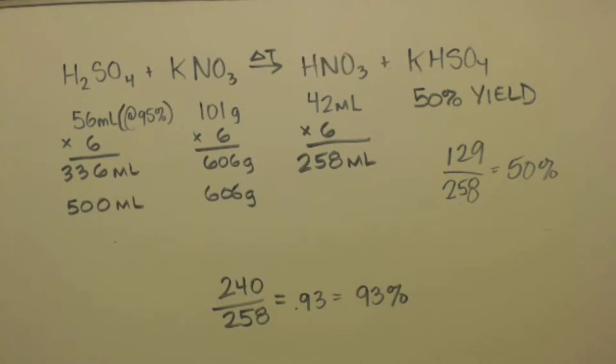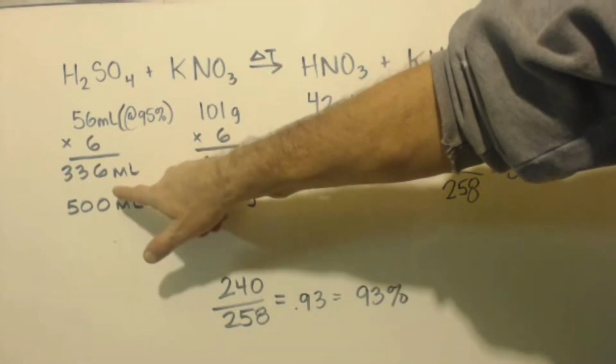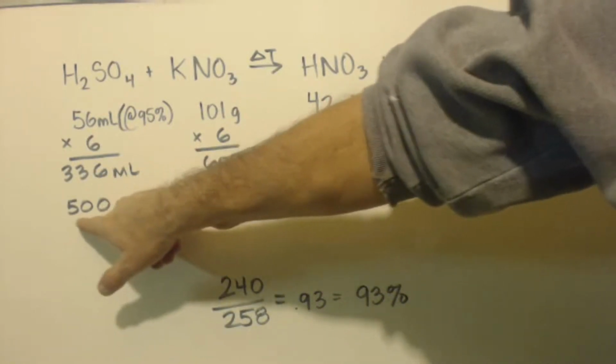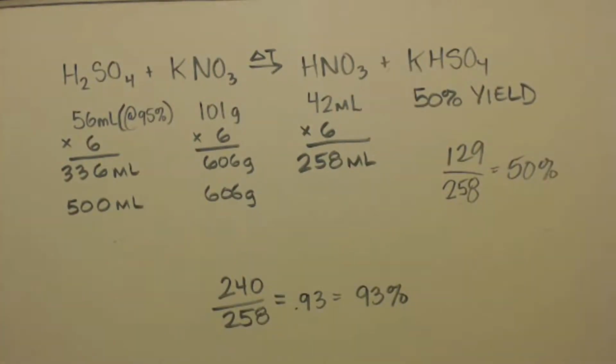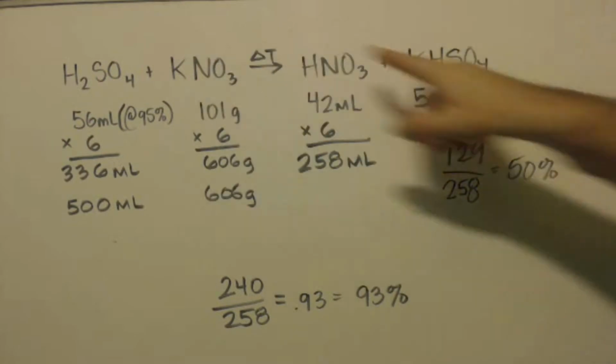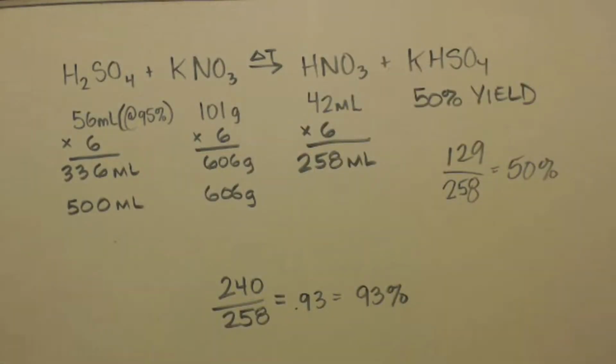But this time, I added in another 144 milliliters, or whatever it is, to get me up to 500. This time, instead of adding 336 milliliters, I added 500 milliliters. Why? Well, my reasoning was this. First of all, there's always a big chunk of salt in there. When this reacts, it makes this, and so you have this salt plus a little bit of that salt in there. It's just a big chunk. It gets in the way.